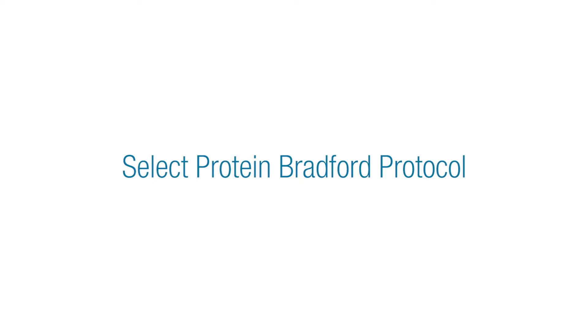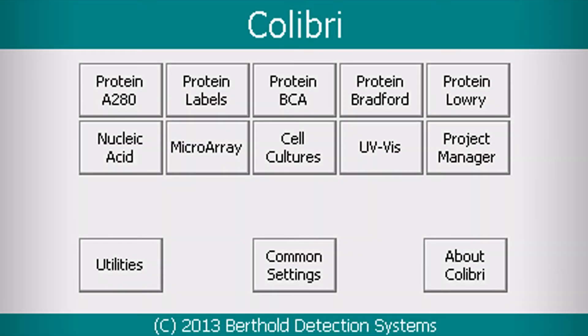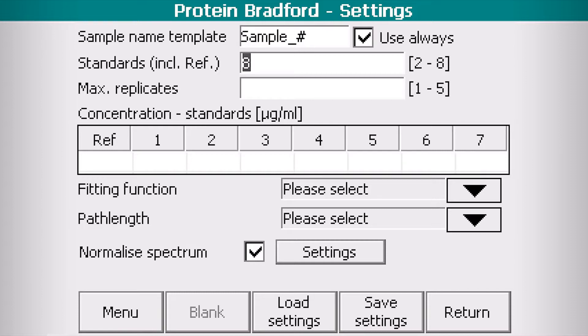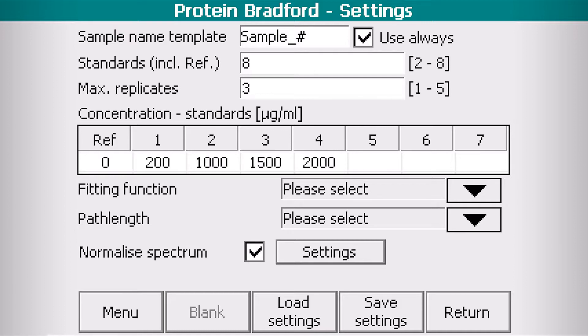From the menu of 9 ready-to-use protocols, select Protein Bradford. You may edit the sample name. Up to 8 standards, including the reference standard and 5 replicates per standard, can be input for the construction of your standard curve.